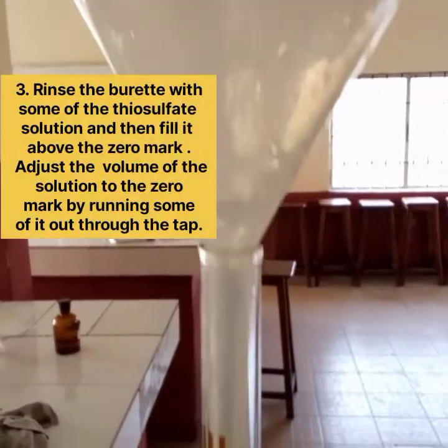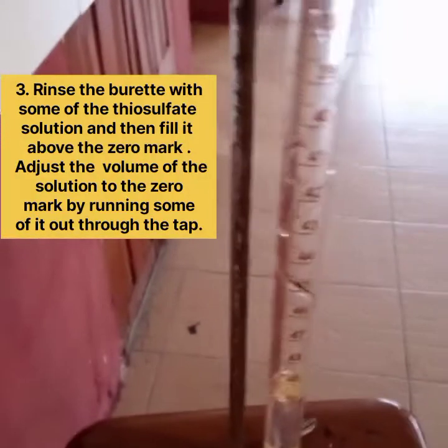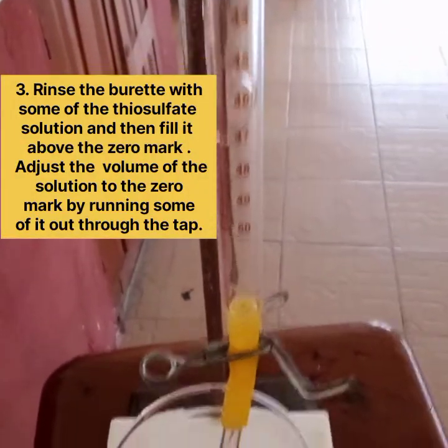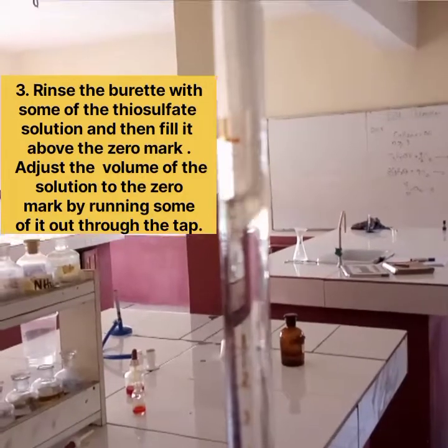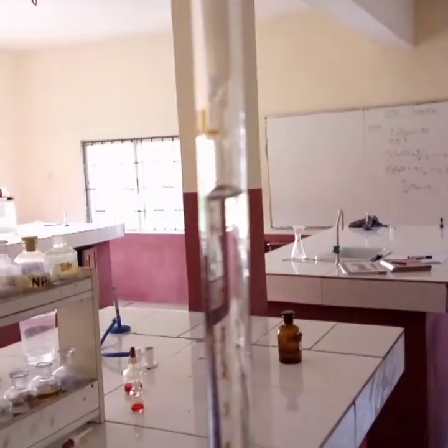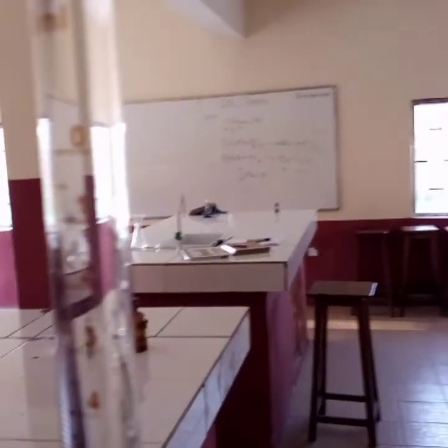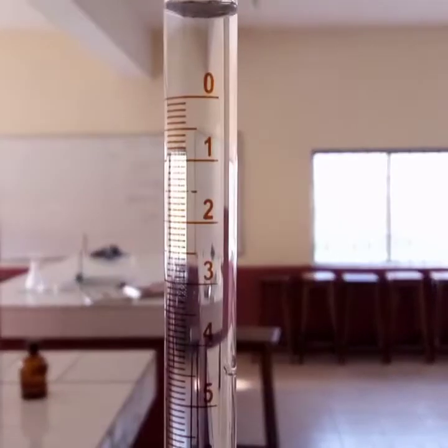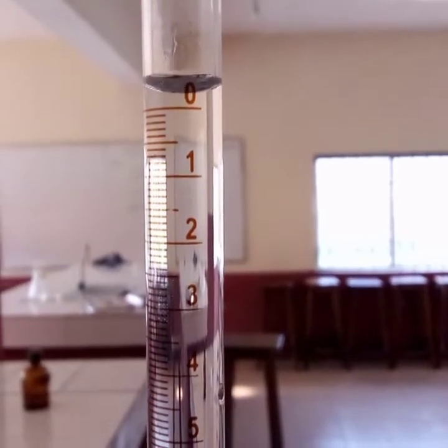Rinse the burette with some of the diluted solution, then fill it above the zero mark. Adjust the volume of the solution to the zero mark by running some of it out through the tap.